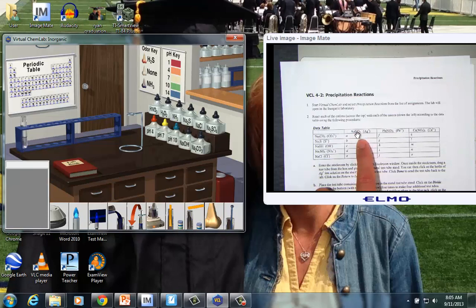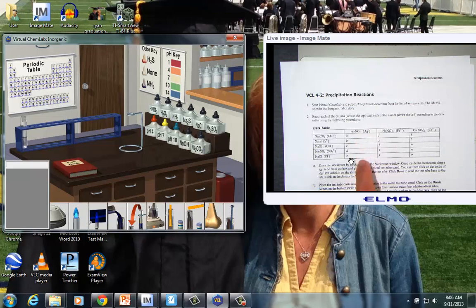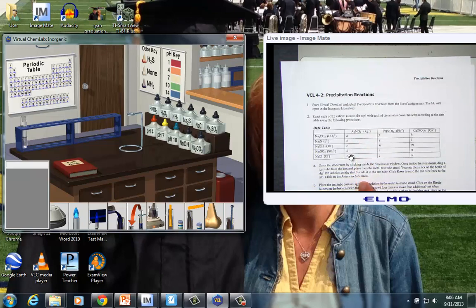What we want to do is actually have enough test tubes to run all the trials at once. I don't want to have to click back and forth into the stock room every time I need silver ion. And notice here, over on this side again, we have one, two, three, four, five trials we have to run for A, B, C, D, E. So I need a total of five test tubes.